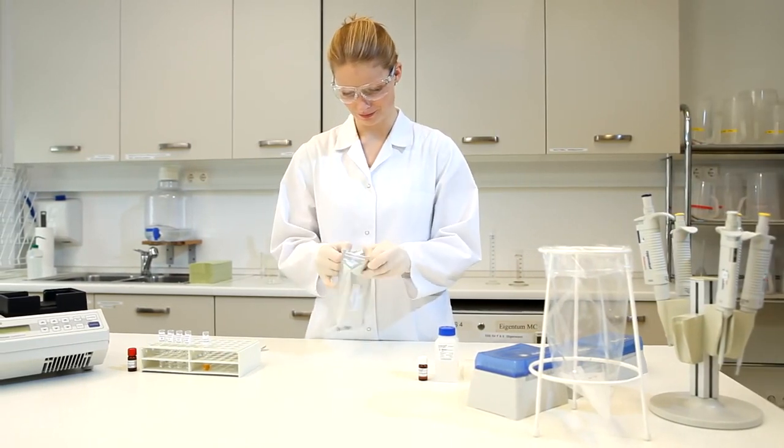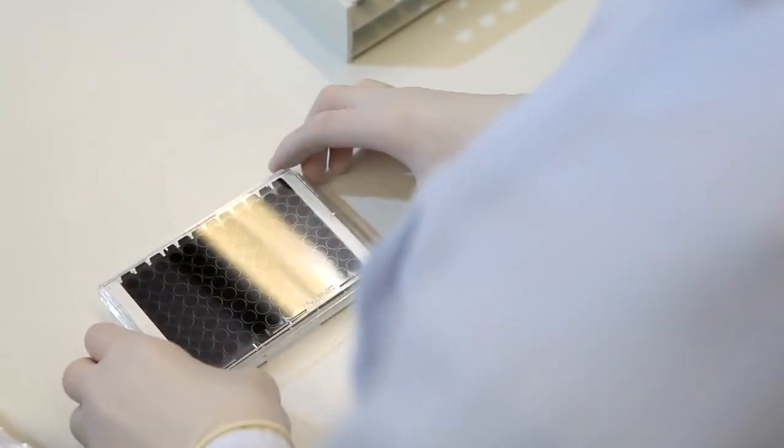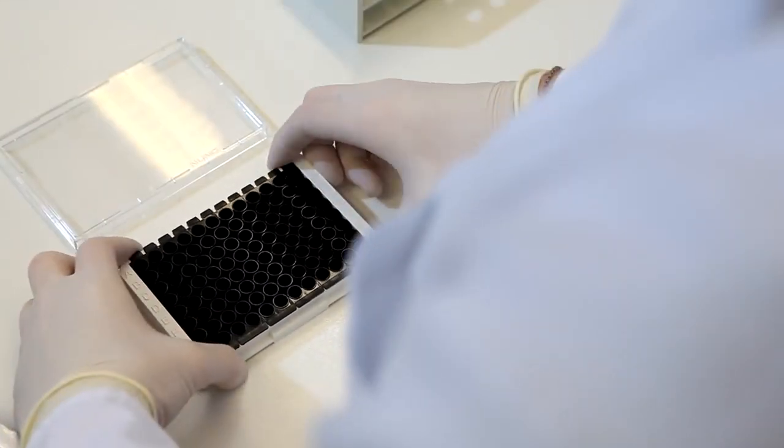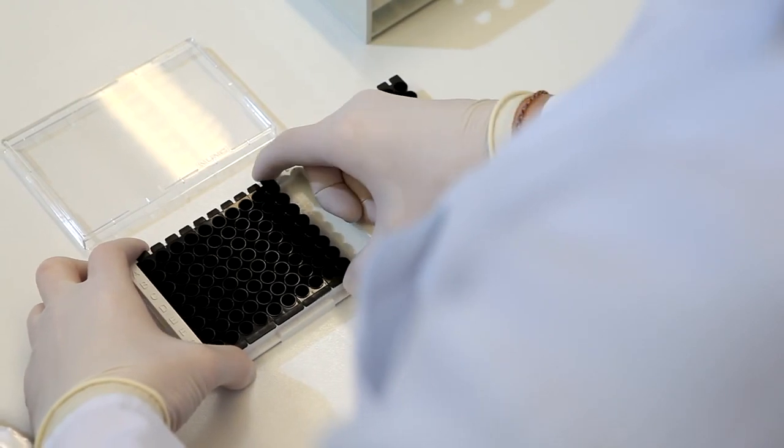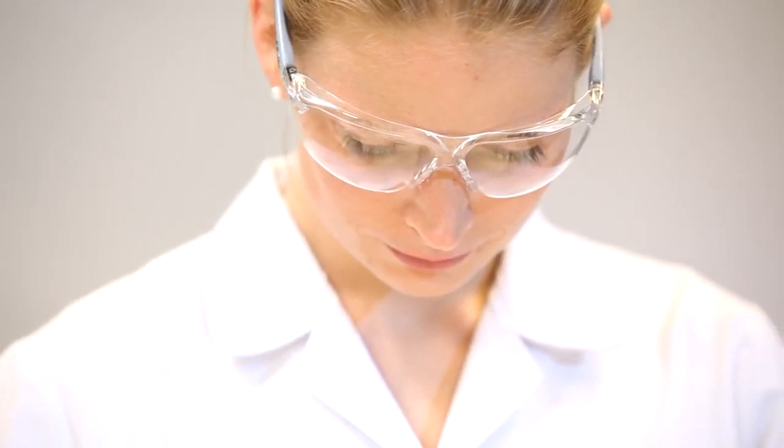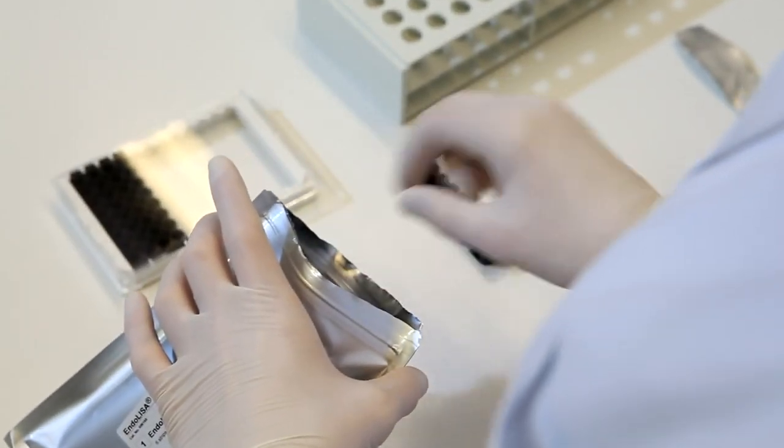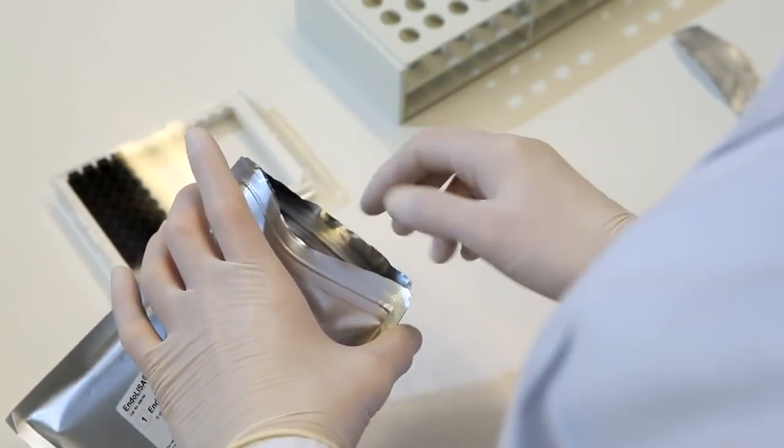Remove unused strips from the microplate. Put these in the resealable aluminium bag provided and store at 2 to 8 degrees.